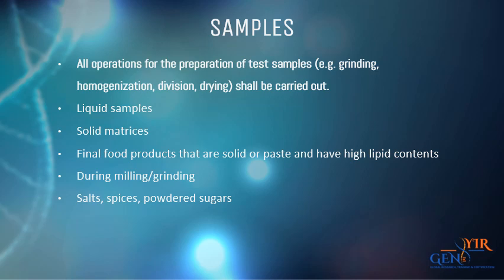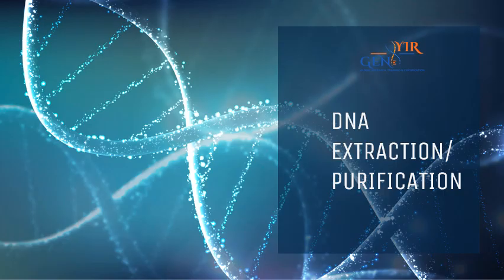As a rule of good practice, any dust-producing methodological step should be contained from all other analytical steps. If salts, spices, powdered sugars and/or other substances that could potentially interfere with the extraction or analytical method are present, appropriate purification steps should be considered according to the selected method. For example, in samples from composite matrices, the target matrix, for example the breading layer of fish sticks, can be isolated for DNA extraction.